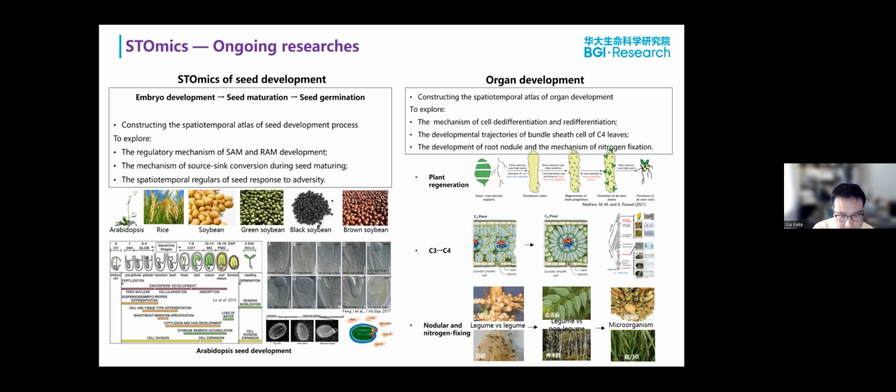For seed development, including embryo development, seed maturation, seed germination, and so on, we will construct the spatial-temporal atlas of the seed developmental process to explore the regulatory mechanism of SAM and RAM development, the mechanism of source-sink conversion in seed maturing, and the spatial-temporal regulators of seed response to adversity.